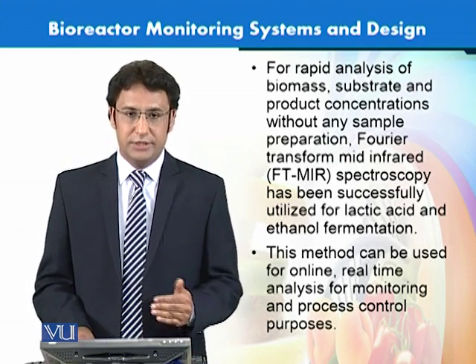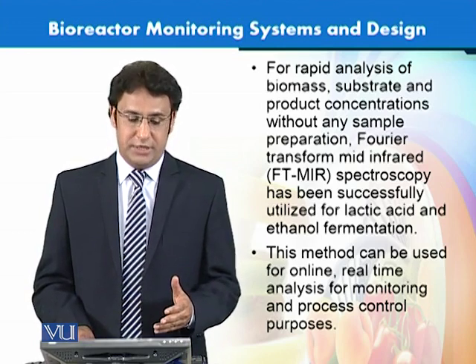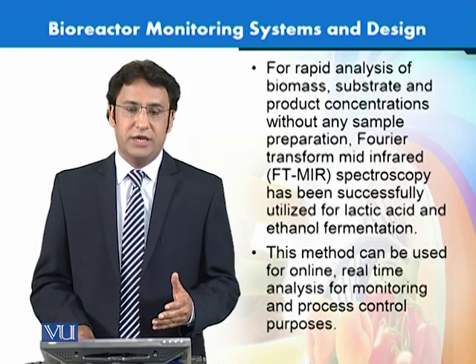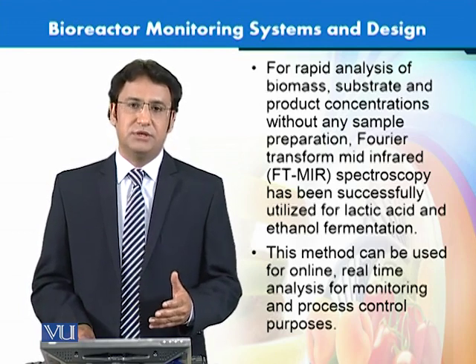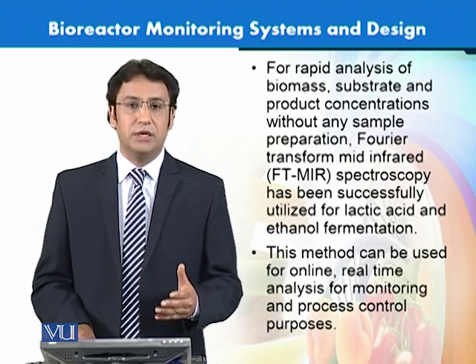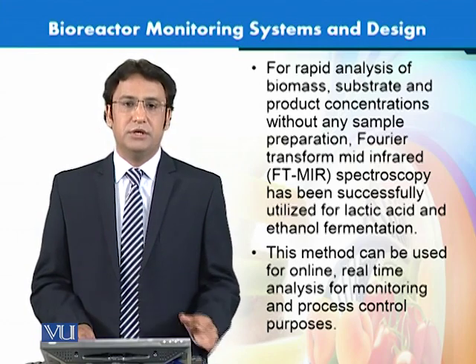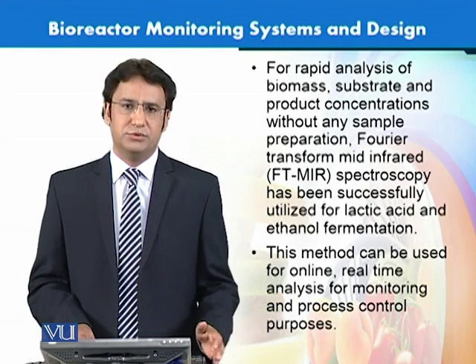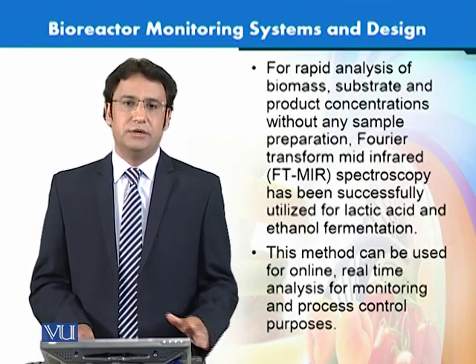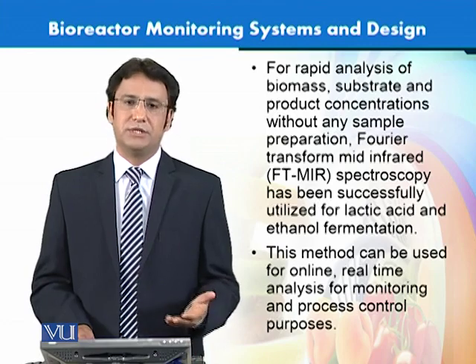So this is a little about the different things that we have to monitor in bioreactors, and the design aspects of bioreactors. This information is very vital for running a real-life bioreactor and a real-life commercial product. These are some of the information that would guide you on what we need to understand in order to have commercial production of a specific compound from selected strains.